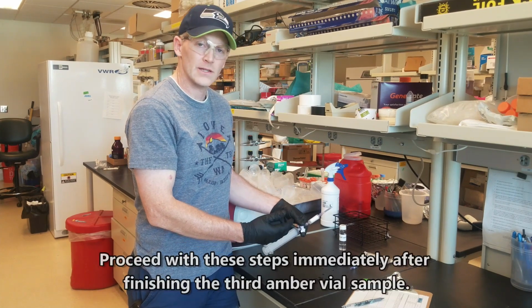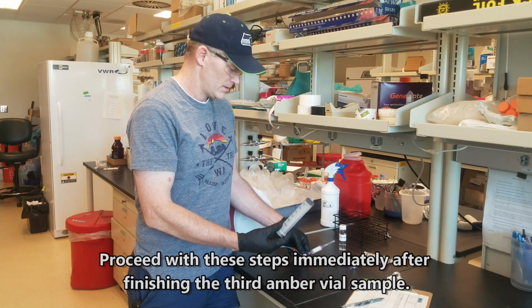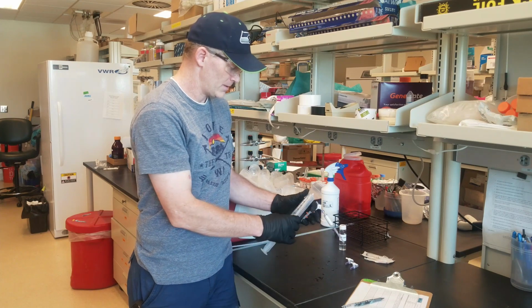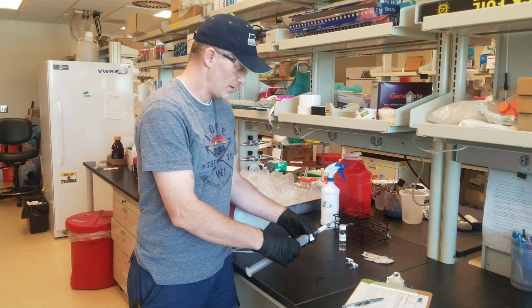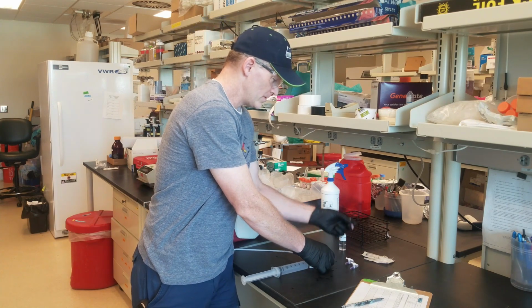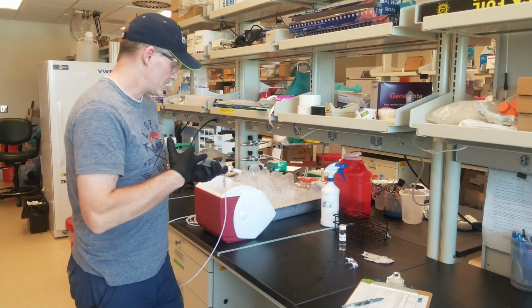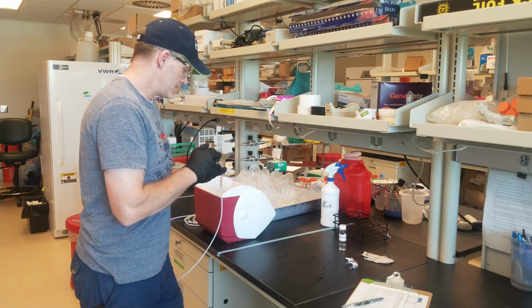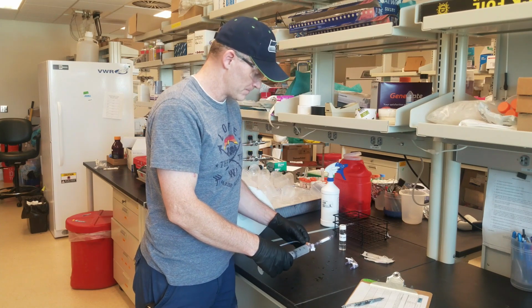First step here is to get the water out of the Sterivex. To do this, just unhook the syringe, fill it with air, goes back onto the three-way valve. Then you want to remove the needle. And the goal here is to push as much water out as you can. It might take a few tries. You can refill the syringe a few times if you like. Get as much water out as possible.